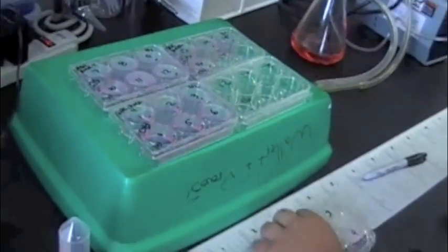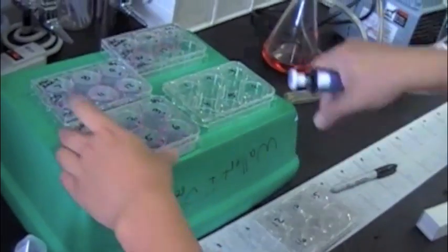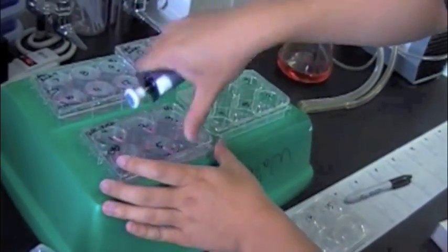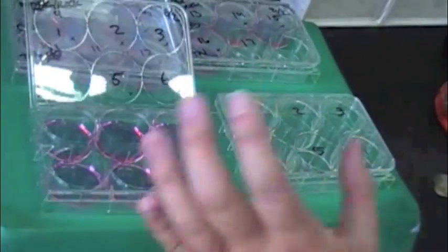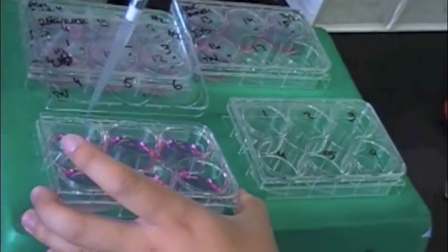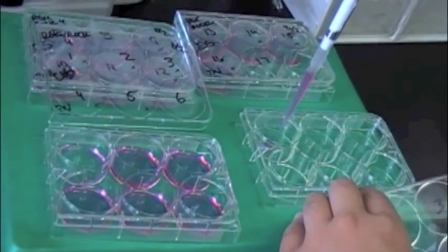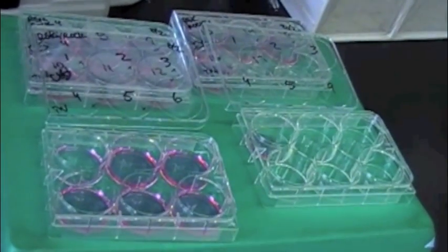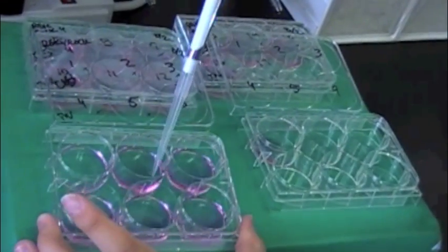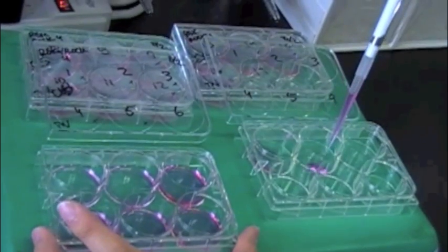Take an empty 6-well plate labeled with the exact same well numbers as the ones you're planning to transfer over. Transfer about 1 mL of media from the old well into the new well, making sure to switch out tips every time to avoid contamination.